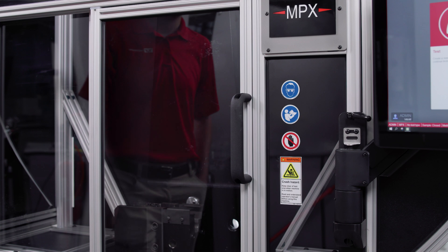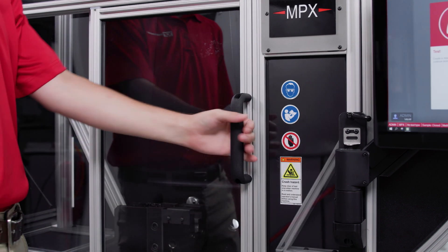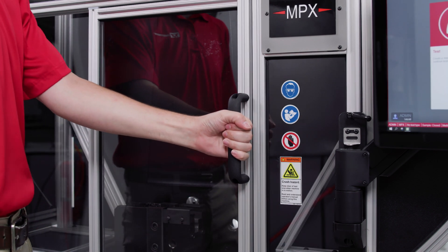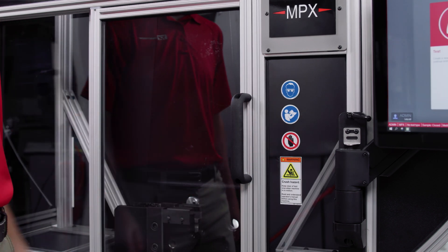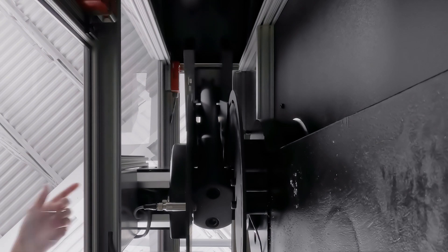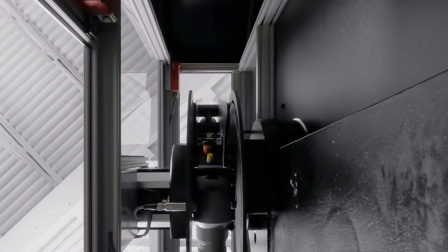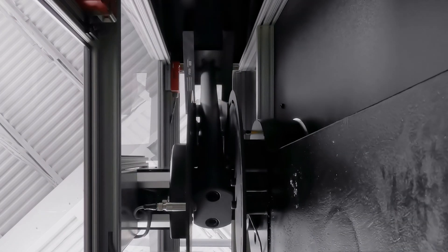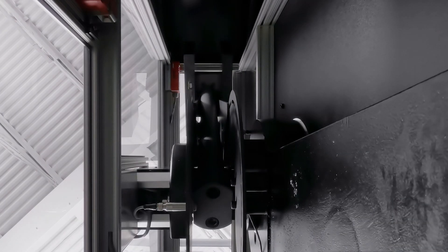As you can see, the system interlocks prevent any access to the test space while the hammer is in motion. After the test is completed, the hammer automatically returns to the latched position ready for the next test.